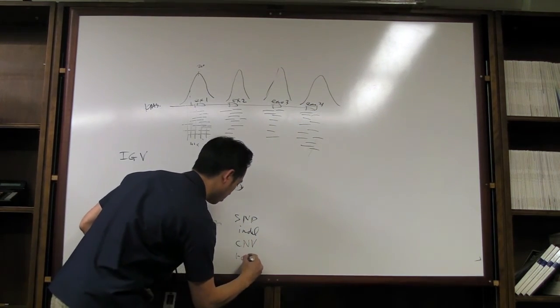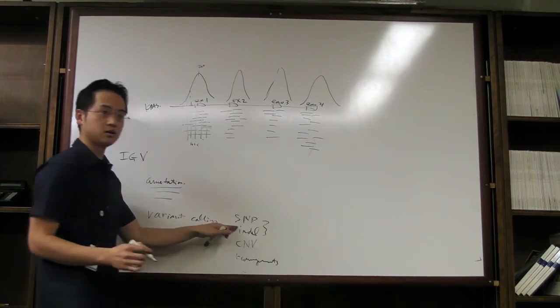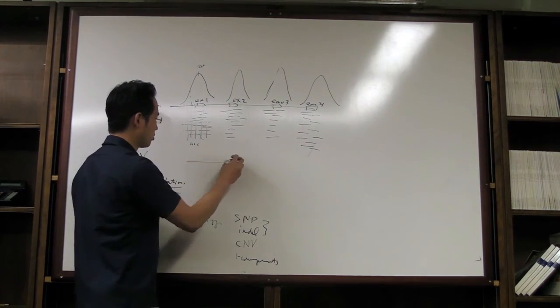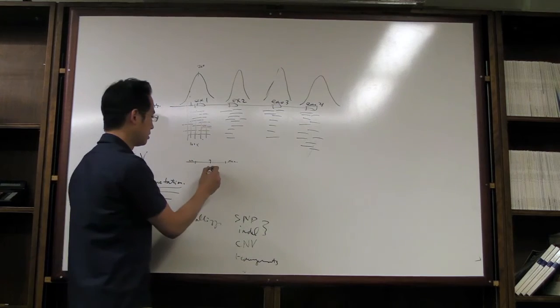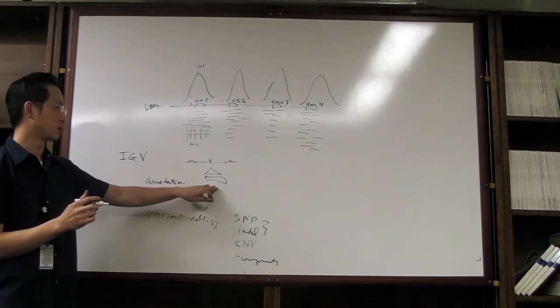Some tools can do rearrangements. Let's just stick with these two for now, okay? So SNP calling and indel. Indel is a bit tougher to do. So you remember I say 80% has to match. So here doesn't match. 80% has to match. If you have a deletion that's quite large, that already kills quite a lot of your capacity.